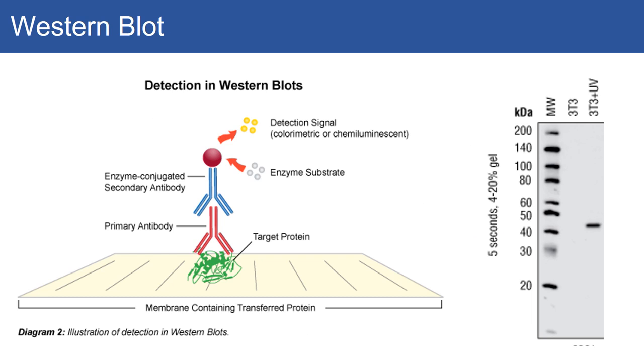So the next type of protein identification is a Western blot. Basically what you do in a Western blot is very similar to a page gel in that you separate it out. In fact, you run an SDS page gel, and then you take that polyacrylamide gel and transfer it onto something like a nitrocellulose membrane, some kind of membrane that the protein will stick to. Then you take antibodies that are very specific to that protein, and they're going to have some kind of enzyme or label on them, and you're going to be able to visualize that label or the effect of the enzyme.